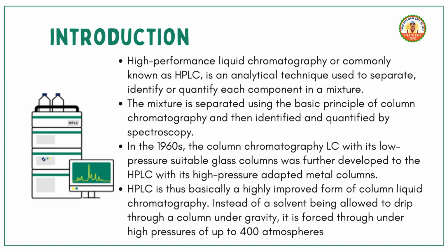HPLC was developed in the 1960s from an older method called liquid chromatography, which used low-pressure glass columns. Scientists improved it by using high-pressure metal columns, allowing them to push liquids through much faster and more efficiently.